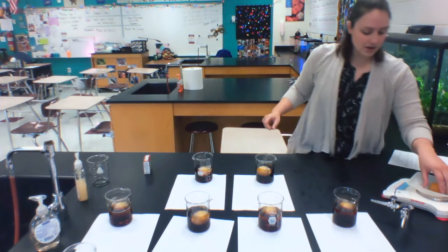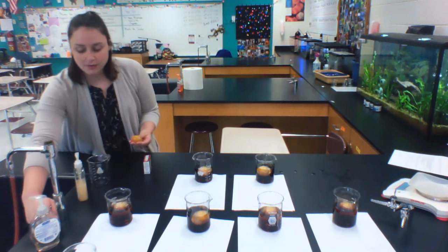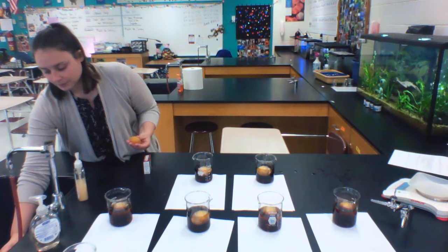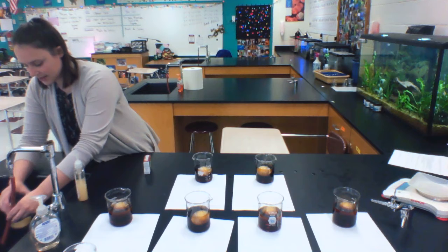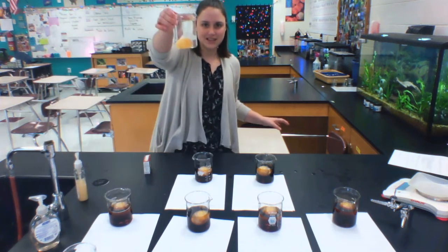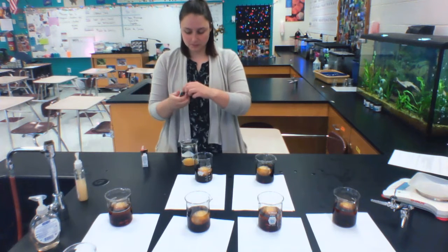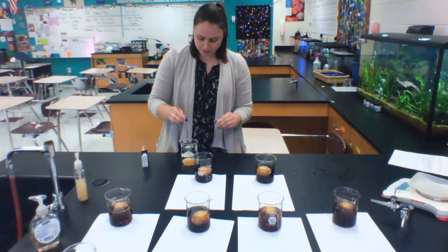All right, so now I have my egg, and I'm going to fill this beaker halfway with water. I don't want to drop it directly into the beaker because I'm worried that it might rupture or burst open. So I'm filling my beaker about halfway up with water, putting the egg in, filling it the rest of the way up with water. You can see the egg is now in there, and we will add some food coloring. Let's do blue just for fun. So I'm going to do 2 drops of blue food coloring.